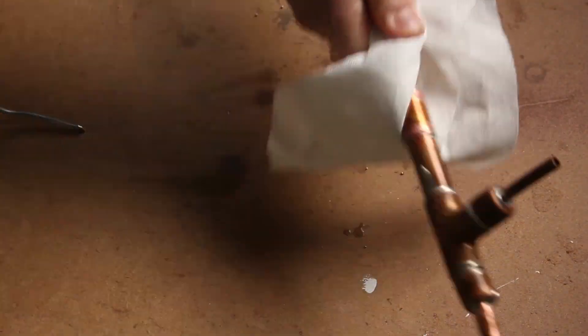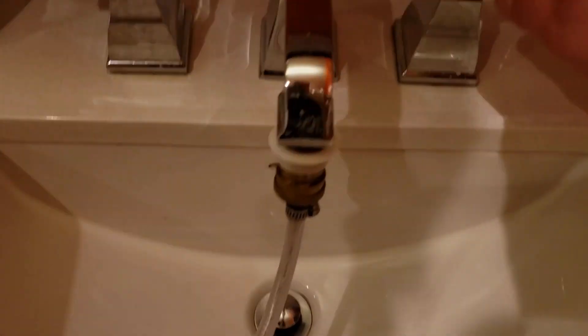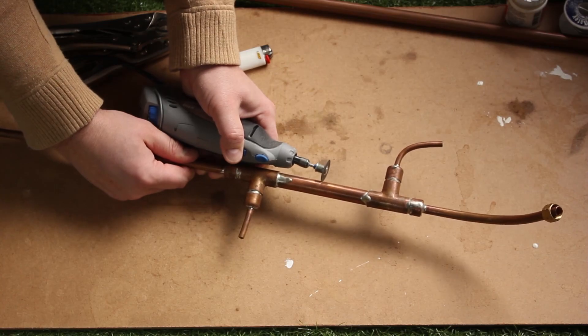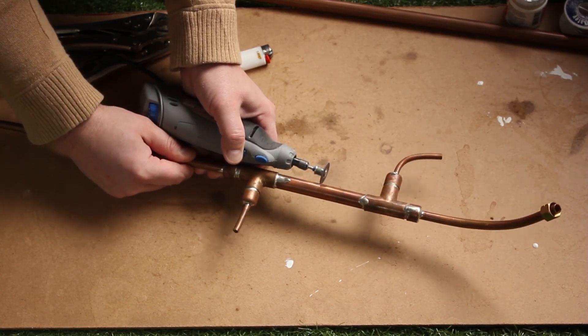Once everything was soldered up and cleaned up, I took it into the bathtub to give it a pressurized test. I almost skipped this part but it turned out to be the most important part of the project. When I first cut a ring around the water jacket with the Dremel, I actually nicked the inside tube and made a leak.